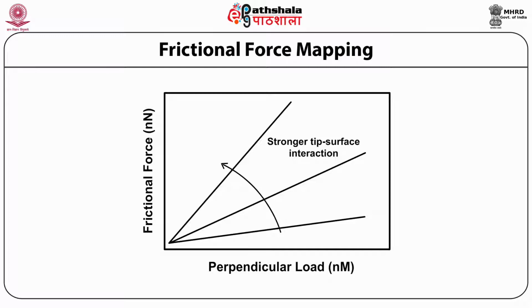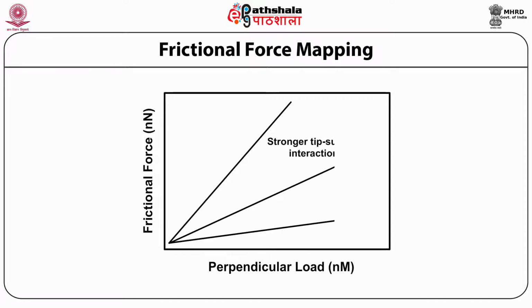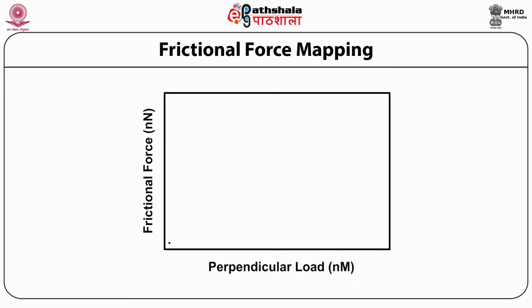Of experimental importance is the fact that contrast between different functionalities on the surface may be enhanced with the application of greater perpendicular force. Of course, this comes at the cost of potential damage to the substrate. This has been indicated with the help of a diagram, which is the plot of frictional force versus perpendicular load.